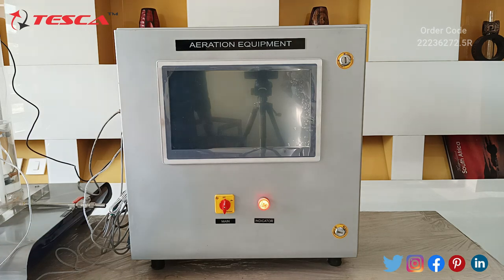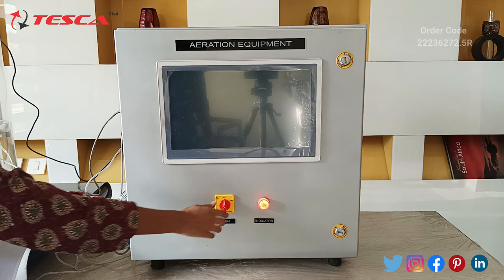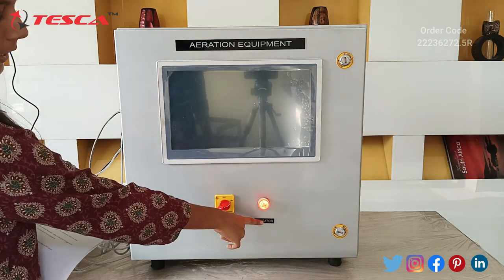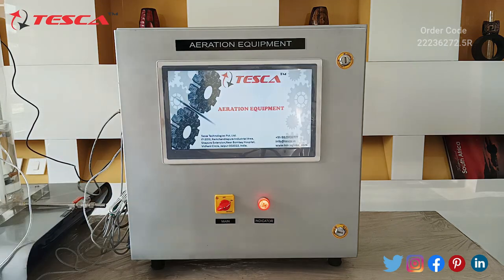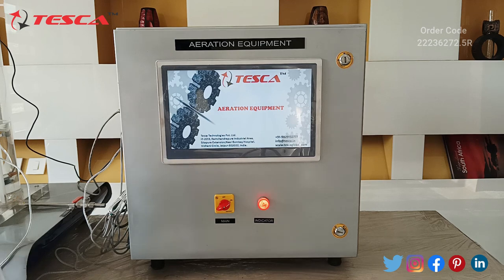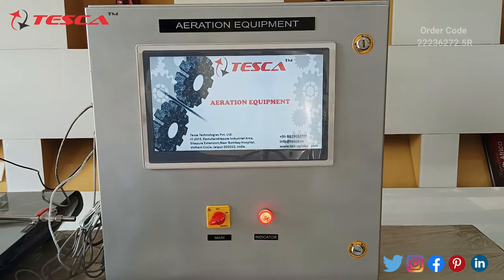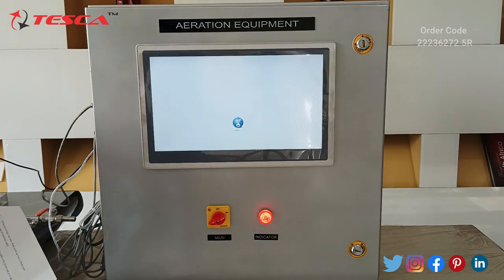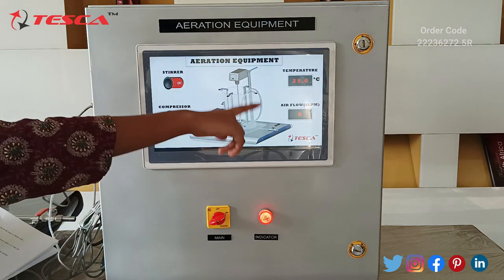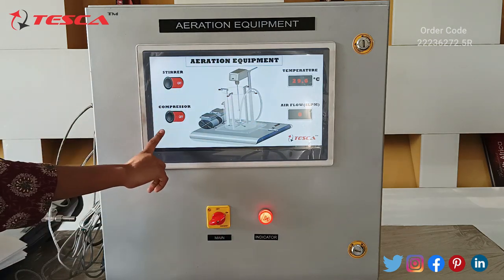Now let's learn about this aeration equipment's working. Here we have the control unit — you can see the main switch. Let's turn on the switch. This is our LED indicator as we told you before. You can see the image of the aeration equipment on screen. From here we can turn on and off the stirrer.